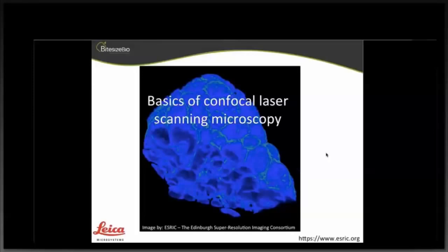When you do take a Z-stack, it is very, very important that you sample correctly, and you can find out how to do that using the SVI website, which has something called a Nyquist calculator. That can give you an idea of the sample step size that you need to use, and also the lateral pixel size that will give you the best sampling rate. If you do this, again, you can use deconvolution, and that can help with the Z resolution.